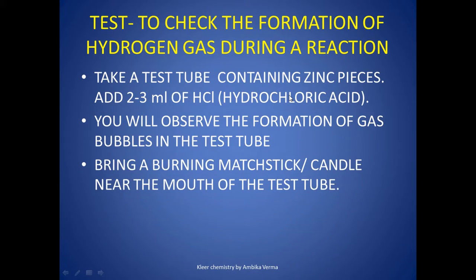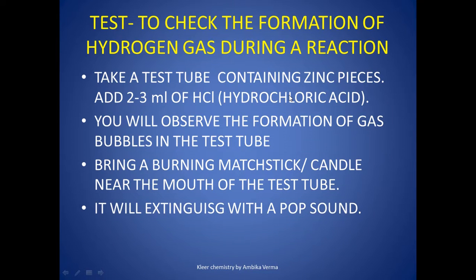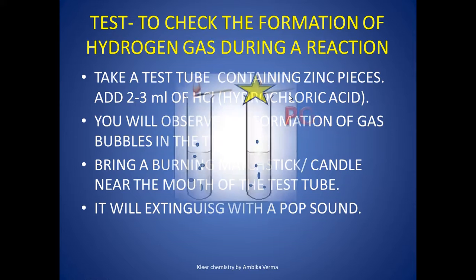Third, bring a burning matchstick or burning candle near the mouth of the test tube. It will extinguish with a pop sound — the burning matchstick or candle will go out with a pop sound.